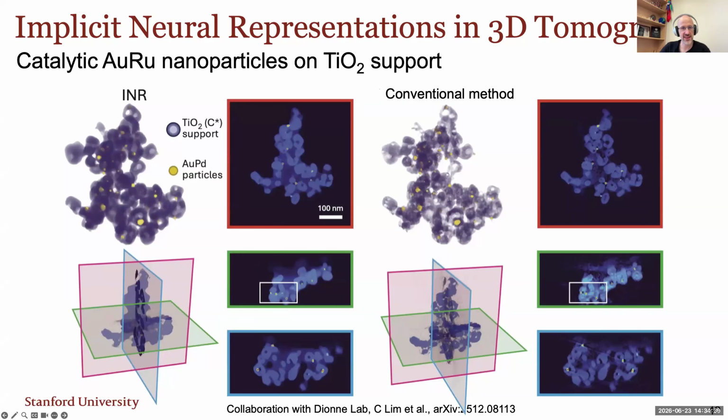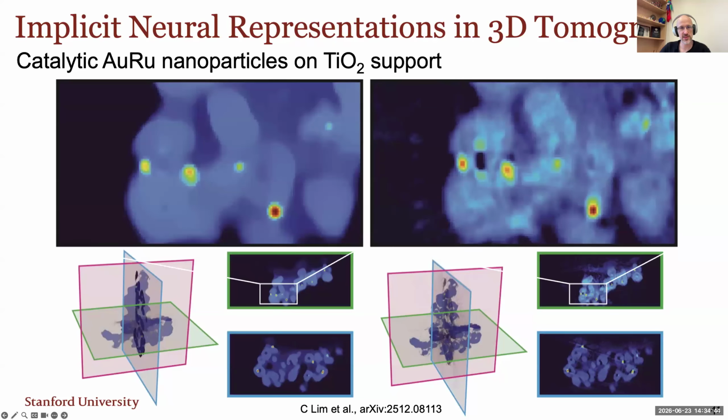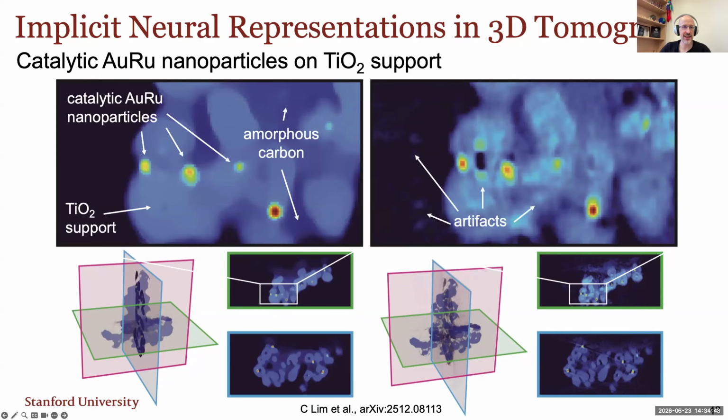So here are 3 slices taken from those 2 reconstructions. And in the interest of time, I'm just going to focus on these 2 slices. So left is the INR, right is the tomography, and it's like night and day.